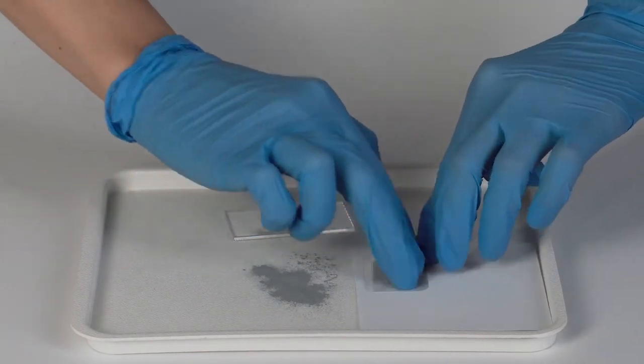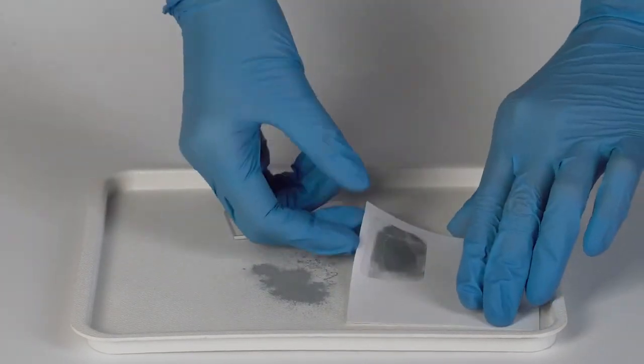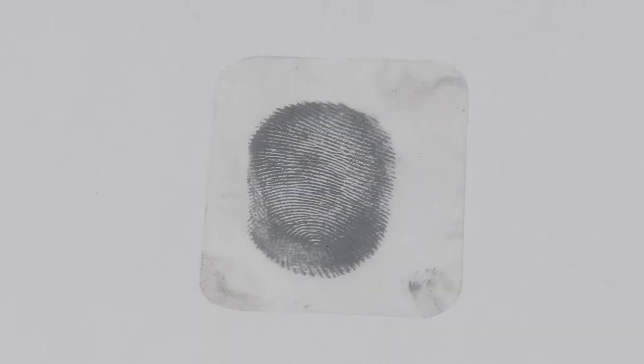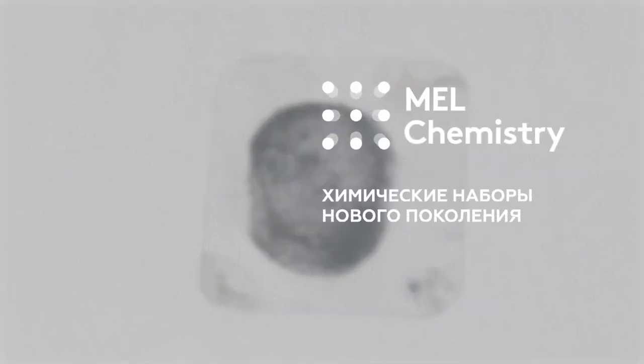You've successfully developed a fingerprint. The surface of the fine zinc particles readily adheres to the oily residue of the fingerprint, creating the dark ridges you see when you transfer the print onto the white paper.